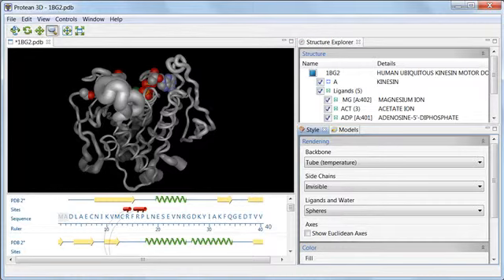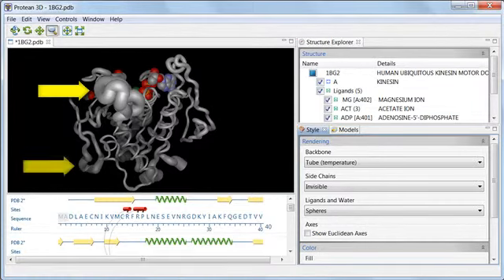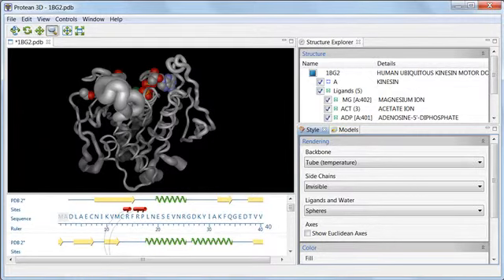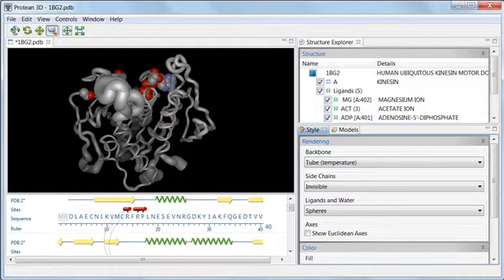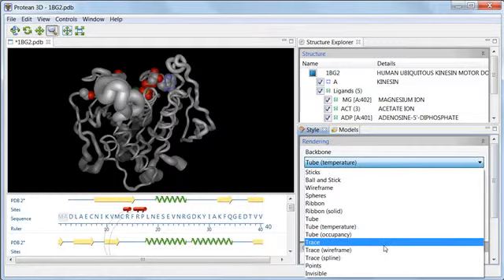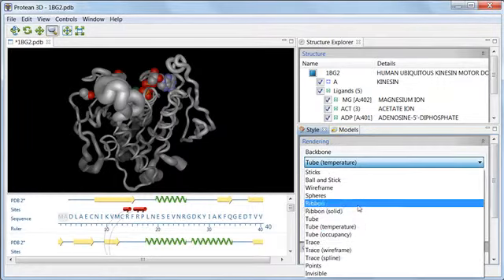High B factors, and therefore thicker tubes, are generally found at the outside edges of a molecule, which is what we are seeing here. However, for this example, I'm not interested in the B factors, so I'll instead change the backbone rendering to Ribbon Style, which is a popular style often used in journal articles.